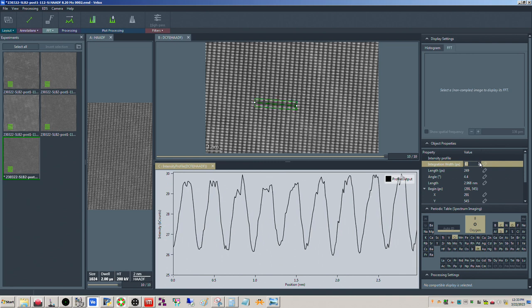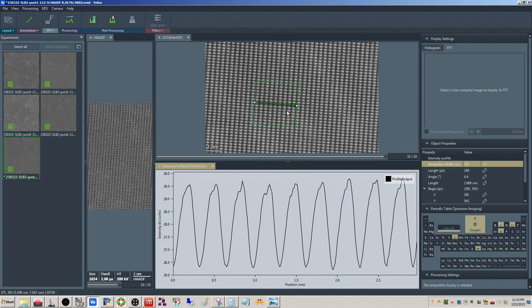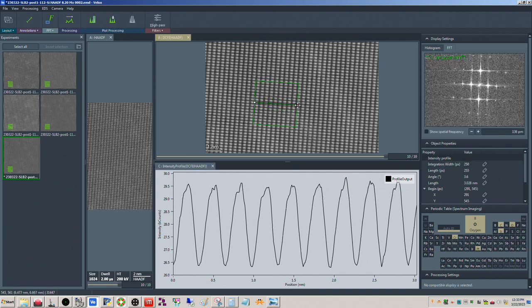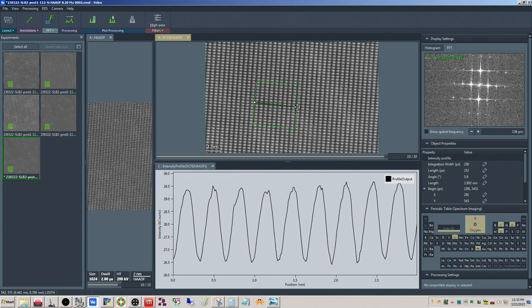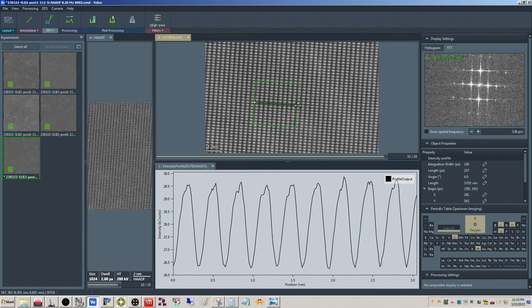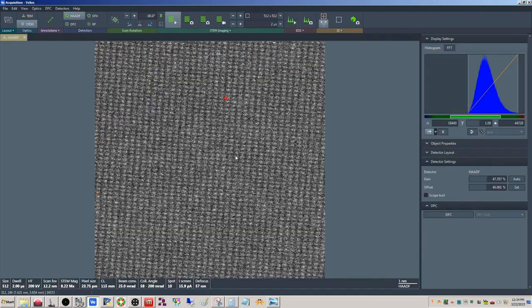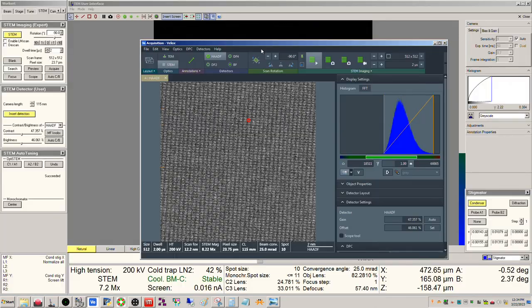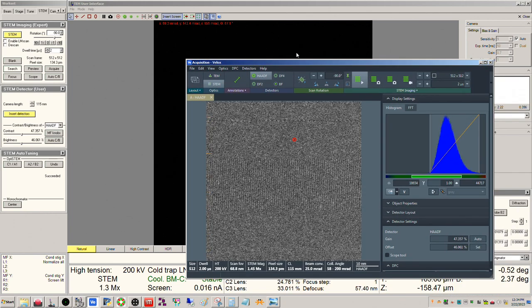So we can integrate this across a bunch of dumbbells here. Okay, but we don't really see it, do we? It's not really showing up there. In some cases it kind of does, but it's not really that evident. The spot's there, it's telling us it's there, but yet at the same time, do we need to try yet another spot? Let's mag out here.